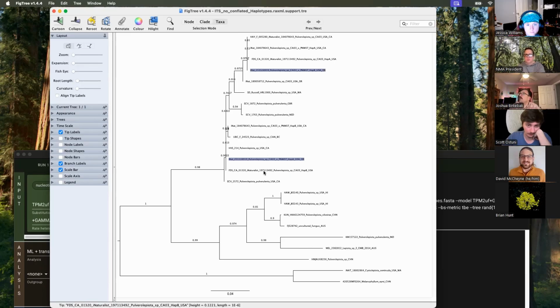Whatever's going on here, there are two distinct sequence variants or haplotypes that are interestingly consistent across 3 collections. That's telling us something odd is happening here, that it's actually more common in our limited sampling, which is pretty limited.